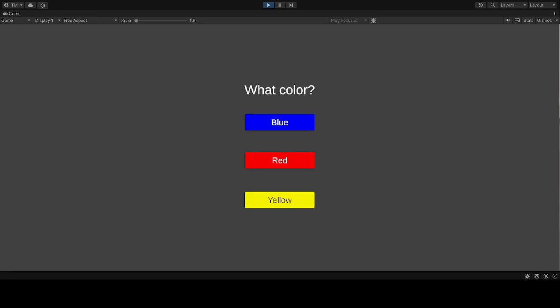Hello. The purpose of creating this was to provide a virtual reality option for the How Much Dye is in a Sports Drink lab in the Chemistry 114 class offered by ASU.